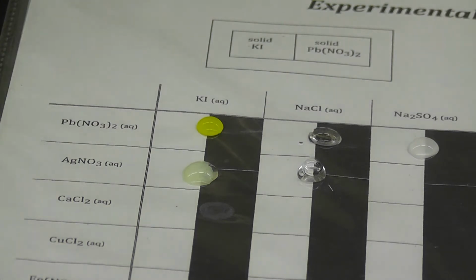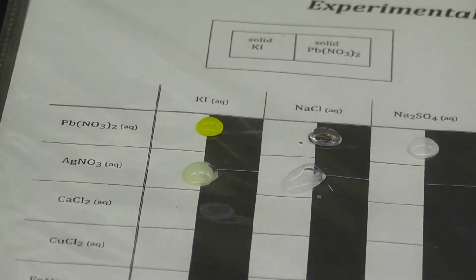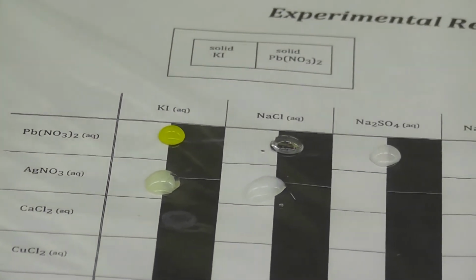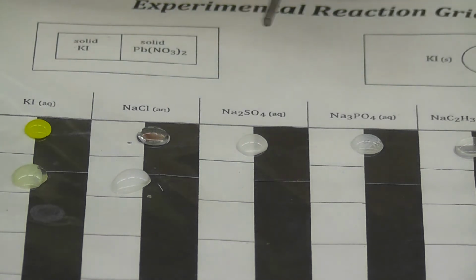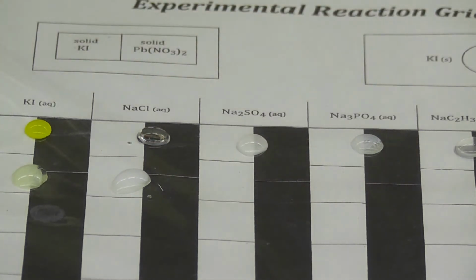So we mix it with the sodium chloride. 1 drop of sodium chloride. Okay. That one not on the black too much, but it did go kind of white if you can't see that. Okay. Okay. So another drop of silver nitrate. Remember, going across the line. This air bubble is not.